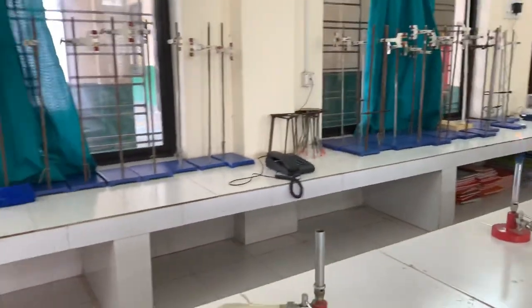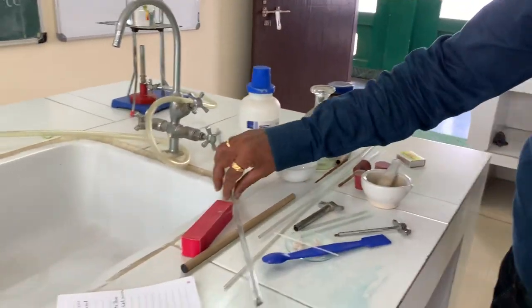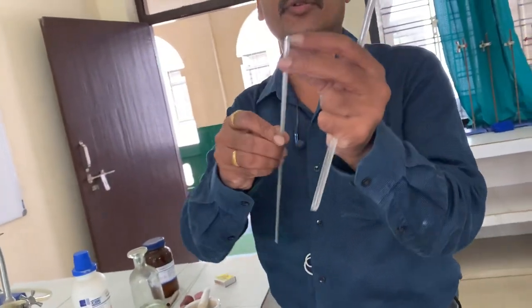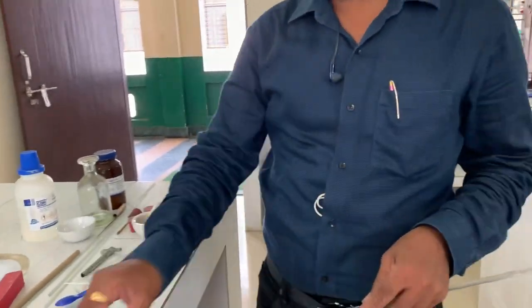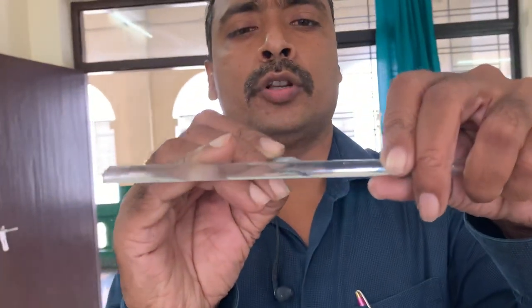Next is cutting of glass rod. This is your glass rod. Glass rod is solid, while glass tube has a hole — you can see the hole in the tube, but there is no hole in the rod. Similarly, you mark the glass rod with your marker pen, because it will be easy to cut if you mark it.